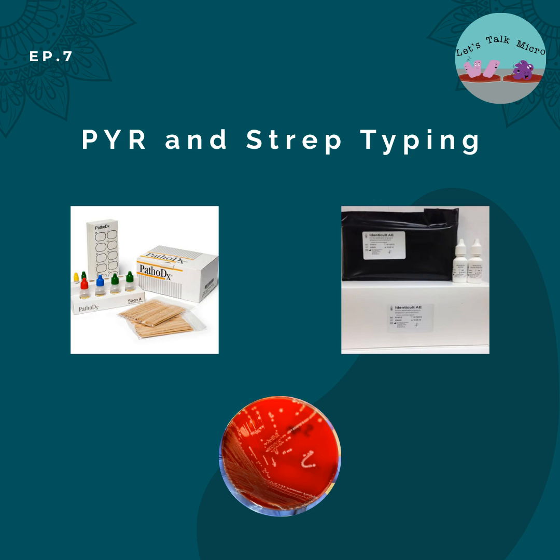Enterococcus as a whole species can have the three hemolysis types: alpha, beta, and gamma. However, in addition to this, sometimes when you sub Enterococcus to a PEA plate, it can be beta hemolytic. So you have to be careful. This is why in the labs that I have been at, when you have a PEA plate, people circle the PEA.